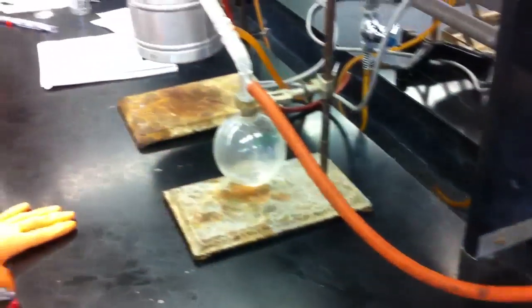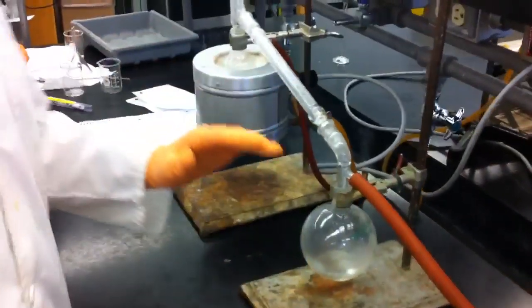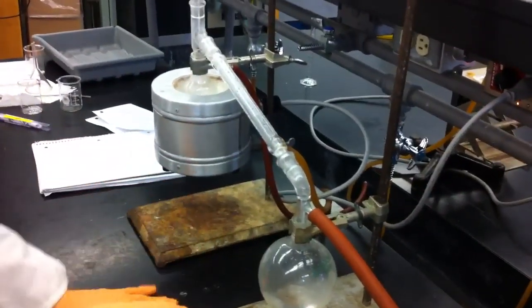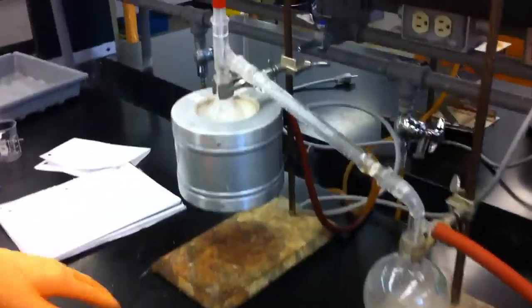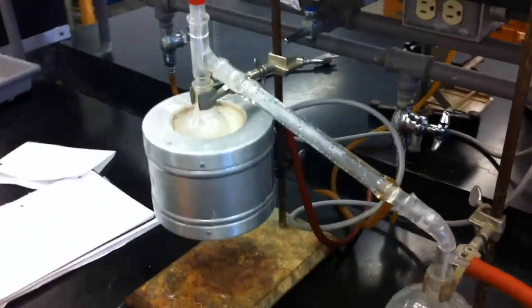The purpose of this is to lower the pressure inside the system in order to lower the boiling point, which will cause our material to evaporate faster, to boil faster.